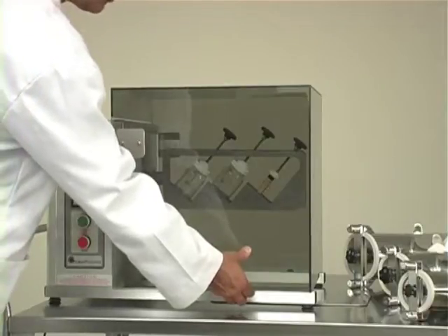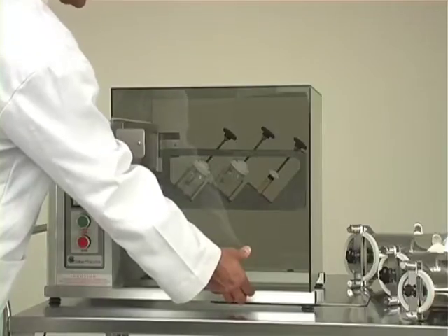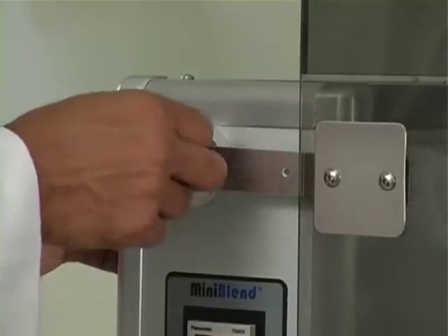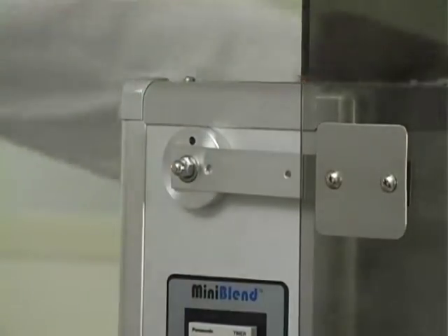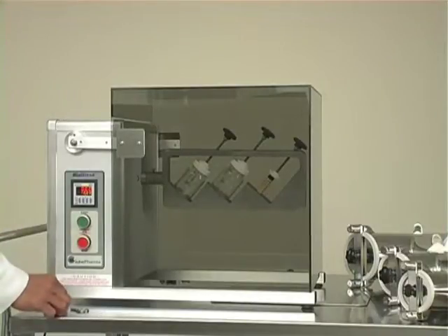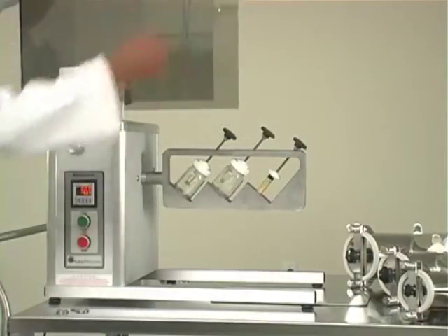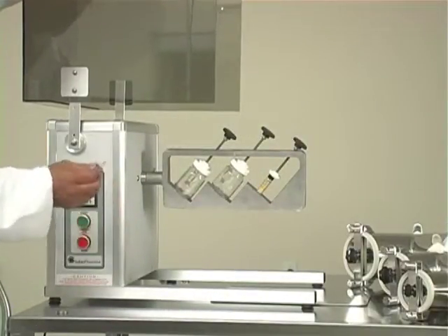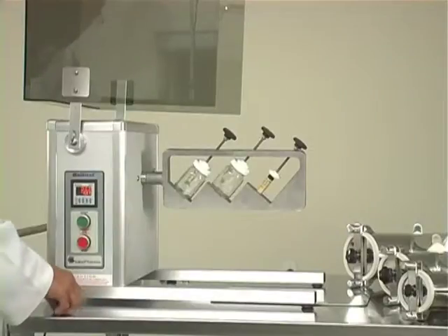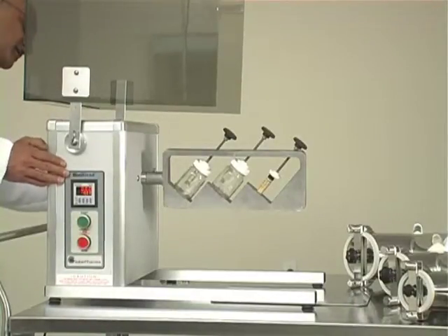This is the polycarbonate safety enclosure. In order to lift it, we have to remove the two pins — there is one on the right side and one on the left side. You just pull the pins outside, then lift the guard up, and then you can lock it in position using the same locking pins. Just insert one pin on this side and the other pin on the other side.